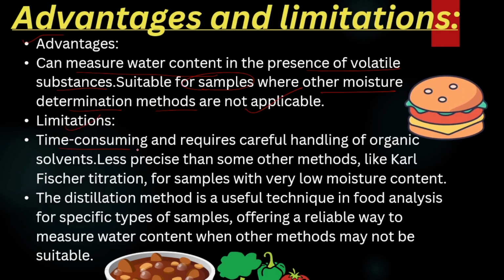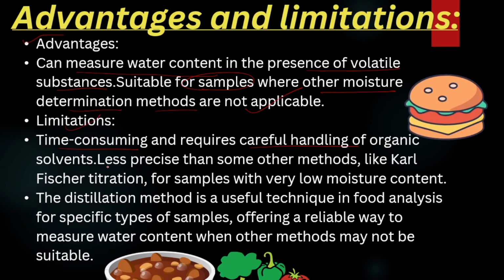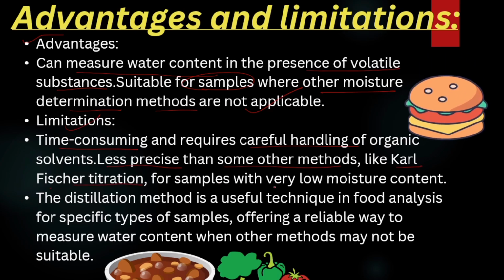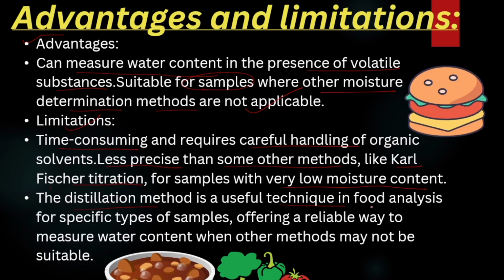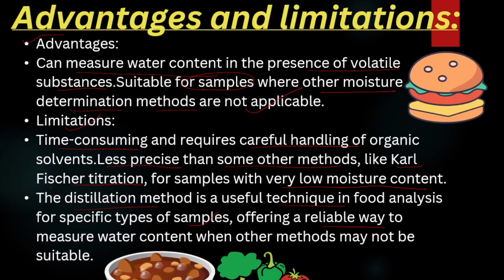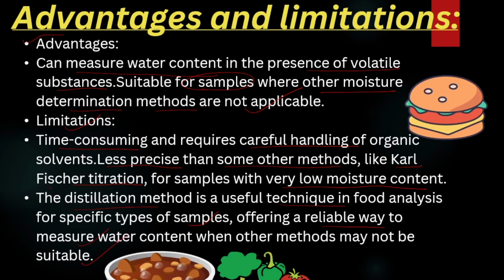Limitations: it is time consuming and requires careful handling of the organic solvent, and it is less precise than some other methods like Karl Fischer titration for samples with very low moisture content. This distillation method is a useful technique in food analysis for specific types of samples, offering a reliable way to measure water content when other methods may not be suitable.